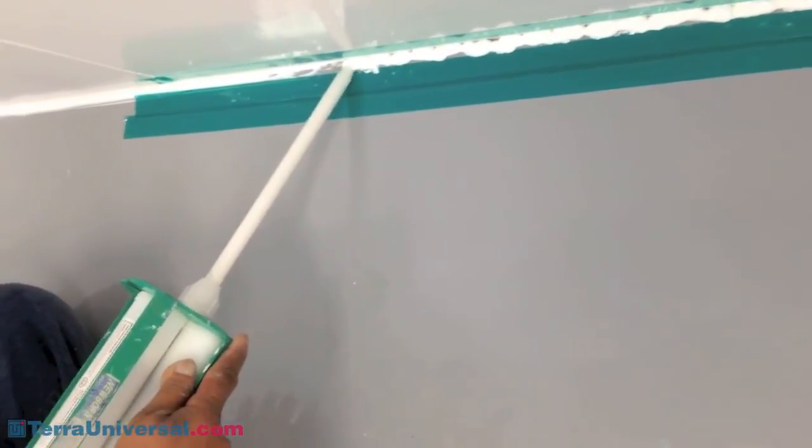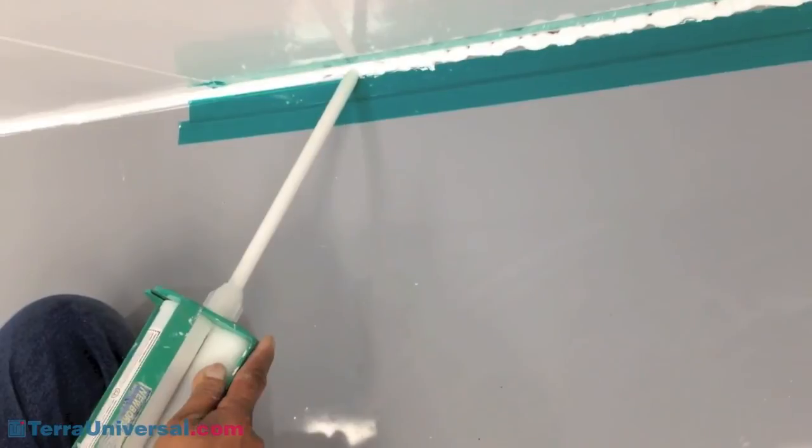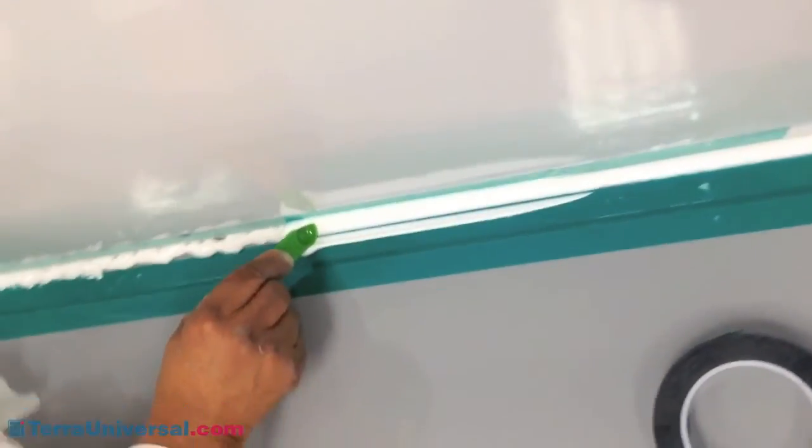Don't forget to apply seam treatment around all fixtures including air vents, utility hookups, window frames, and outlets.